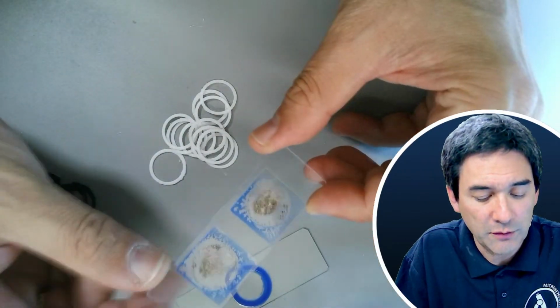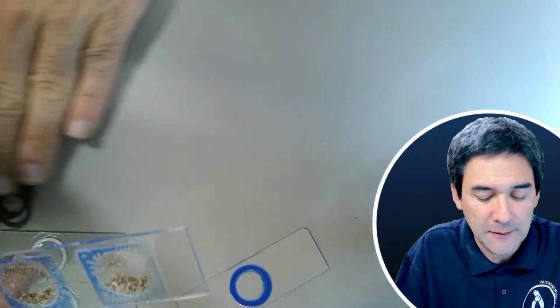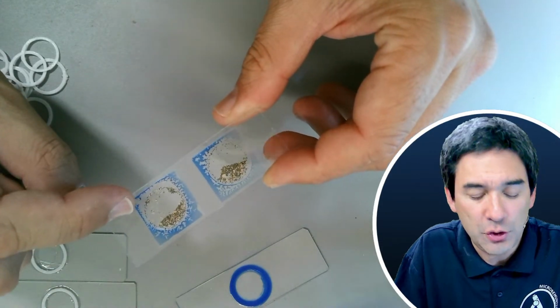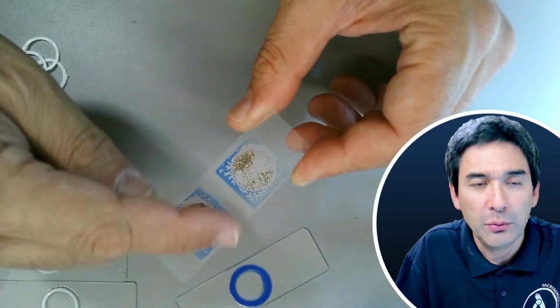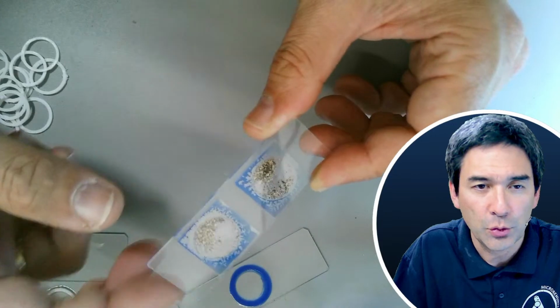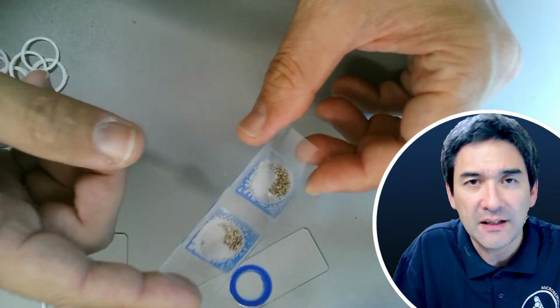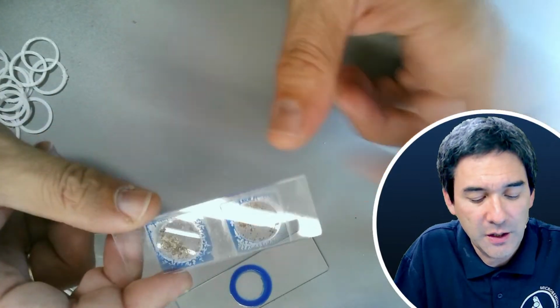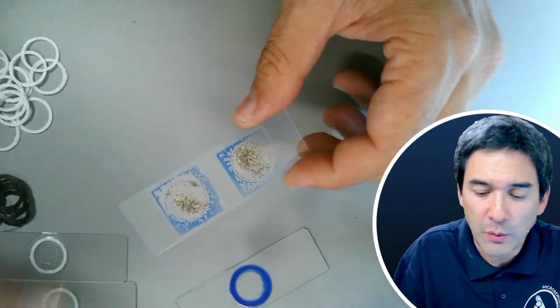This one was actually one of my first microscope slides, using a so-called concave slide. These slides have concave indentations, and I put a sand sample in here, with a cover glass on top, sealed with blue nail polish, so it's easier to see. This means there is no liquid in here, and the sand is surrounded by air. This way you can shake it around a little bit and look at the sand grains always in a different way.